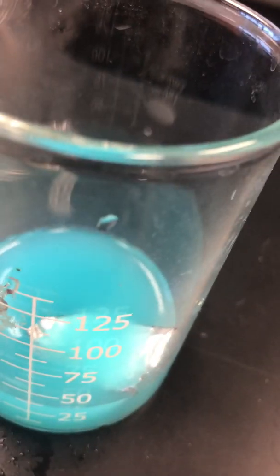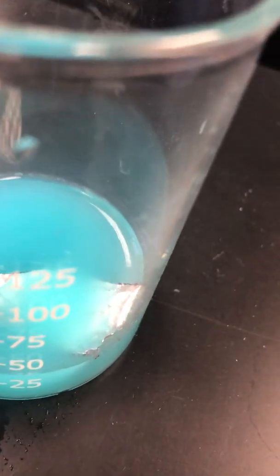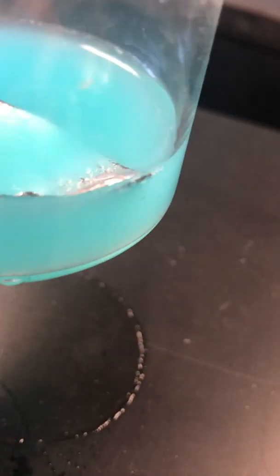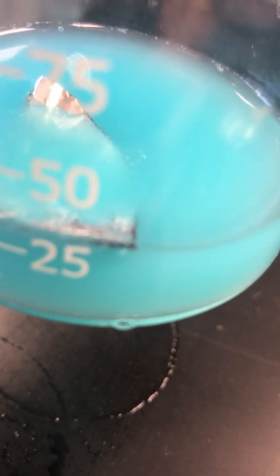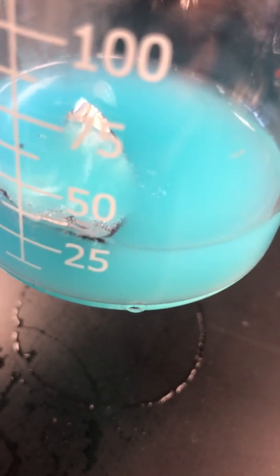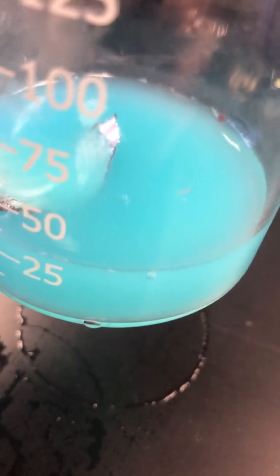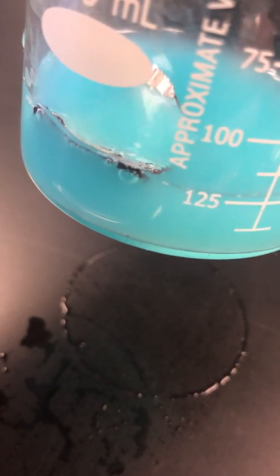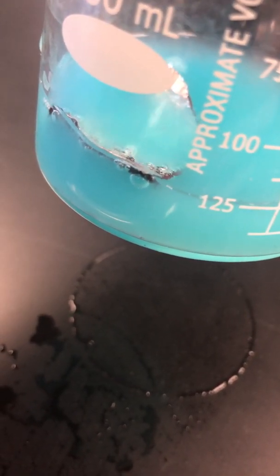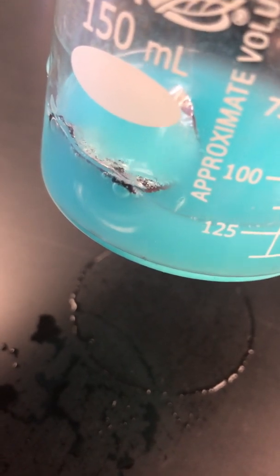Yeah, there's a little bit of a color change going on. It's kind of starting to turn a little reddish brown or maybe even black. It's kind of difficult to tell in this particular image, but oh, you kind of can. You can sort of see some bubbles starting to appear along the sides of the aluminum foil. So a gas is being produced. There we go. Now it's really starting to change. But see all those little bubbles that are forming? They're forming because the copper chloride, the salt, is rusting the aluminum foil.